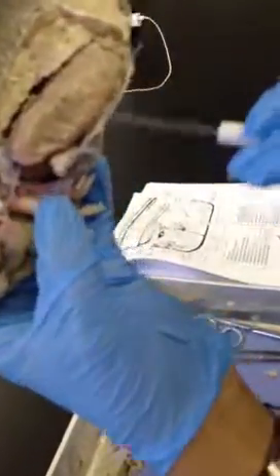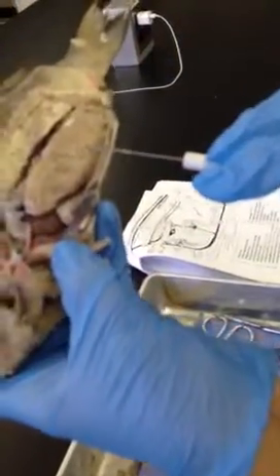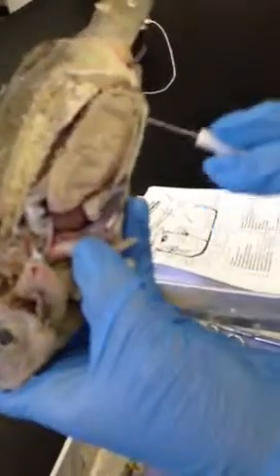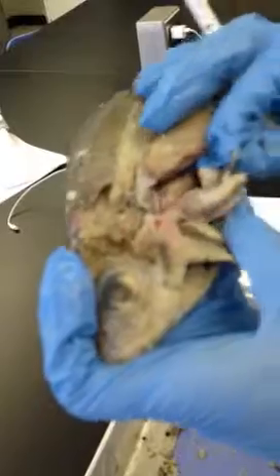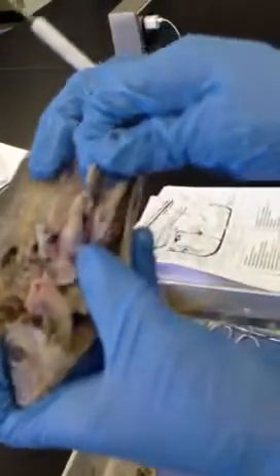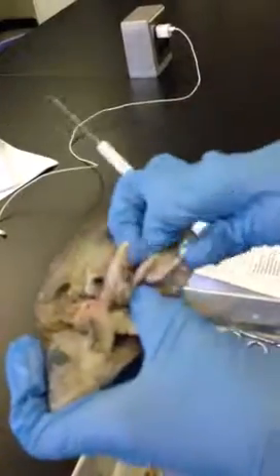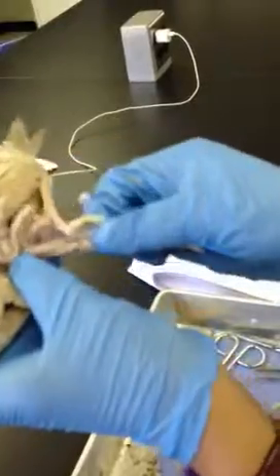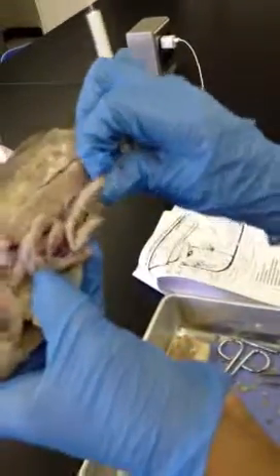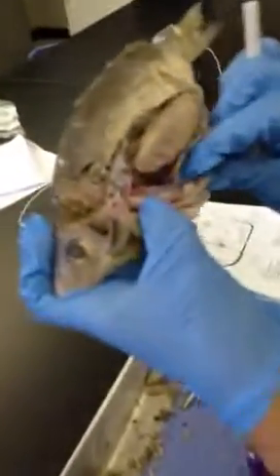We're almost done, people. This is the spleen. This is an ovary, because we can see the egg. So this is the gonad. This is the spleen, like I said, the black part. Right here we have the intestine. There's no large intestine. So this is the small intestine. Now I'm going to let her do the arteries of these intestine things.